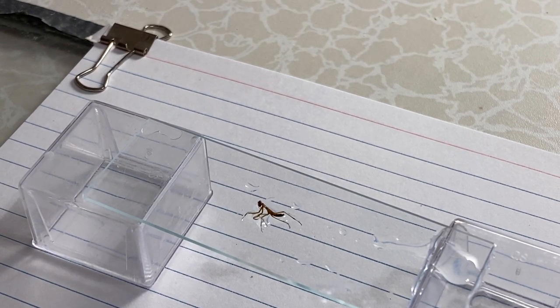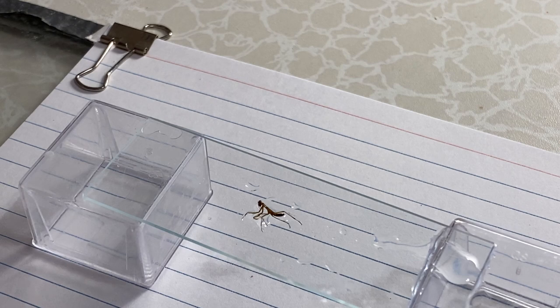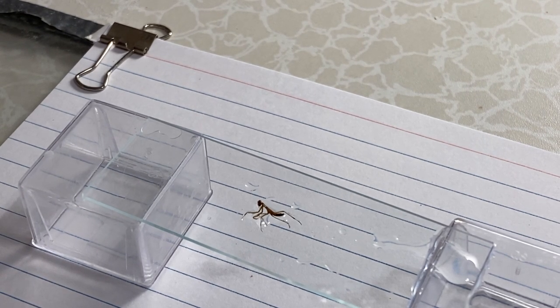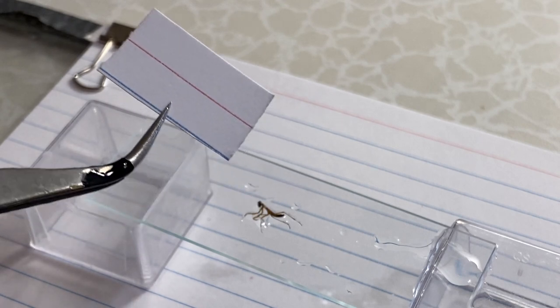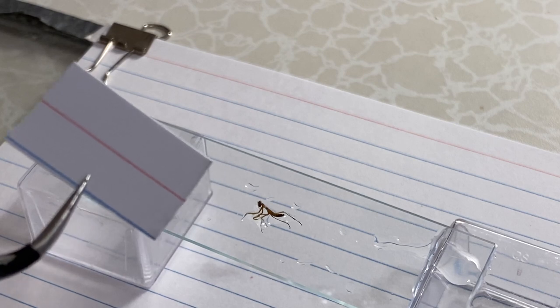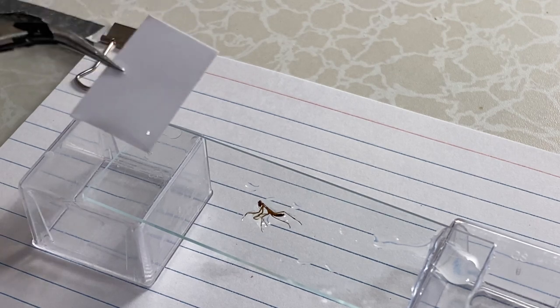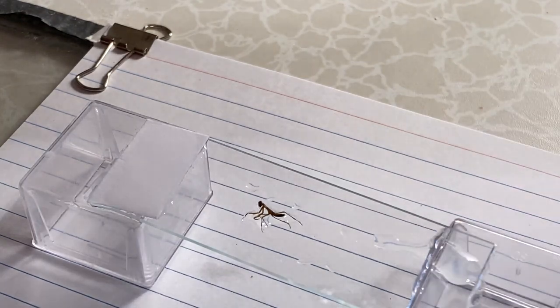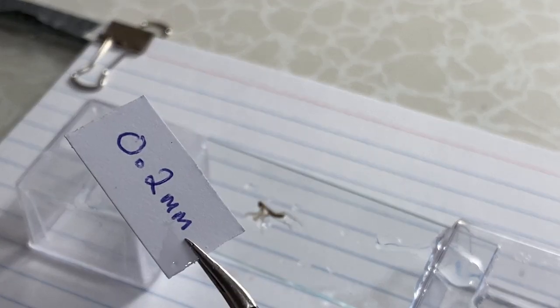The next step is to take the slide and put another slide on top to flatten the insect somewhat, but we don't want to squish it completely — that would destroy all the characteristics. To keep it a little flat, I devised a method of taking an index card, a three by five index card, and cutting it into small sections that fit at the end of the slide.